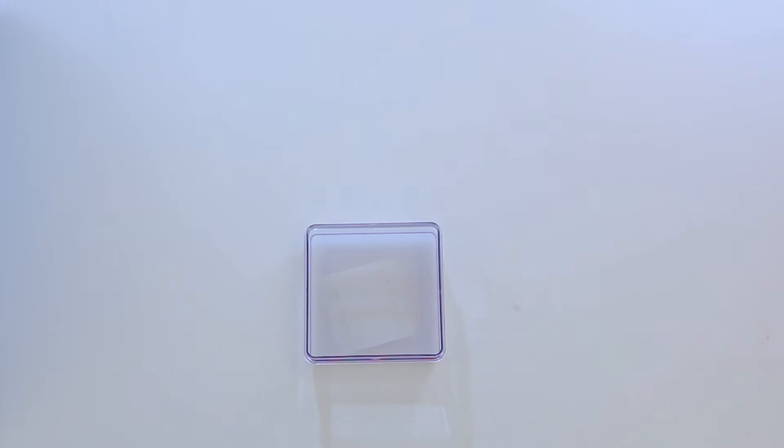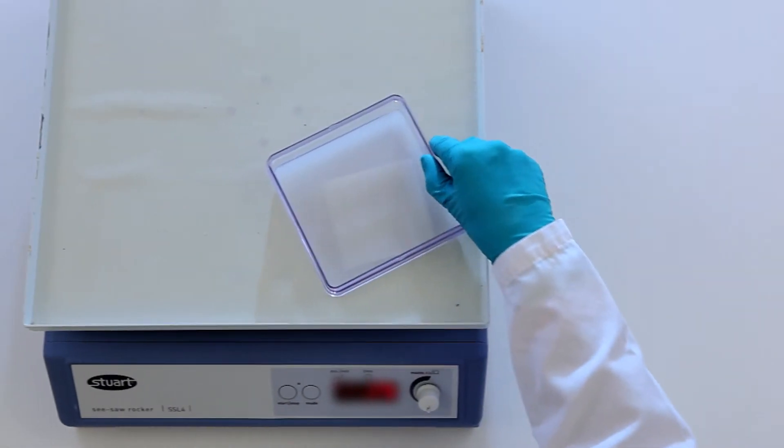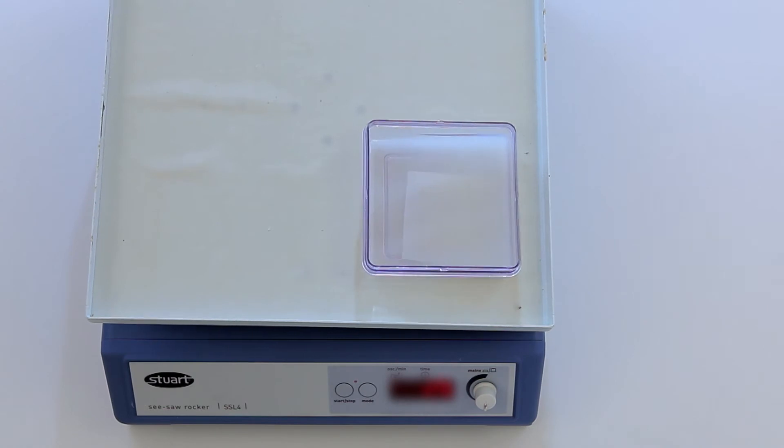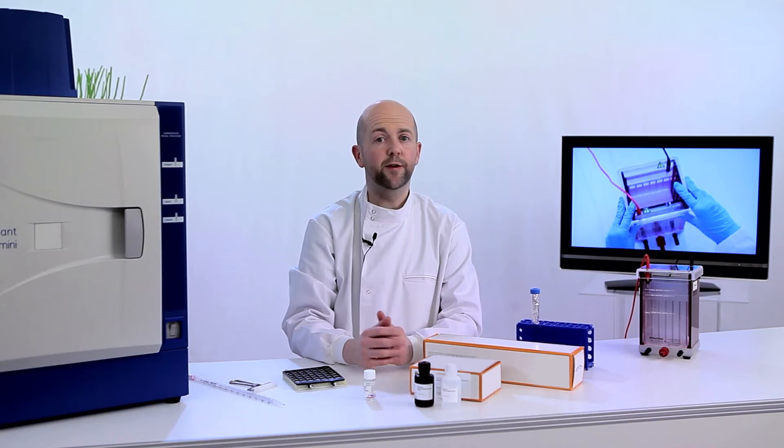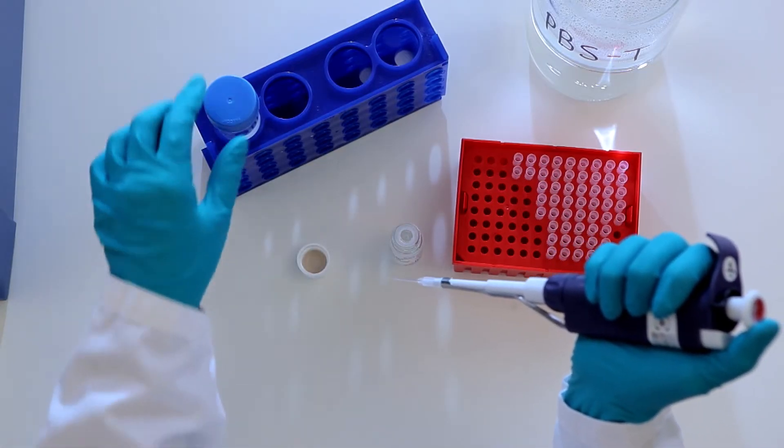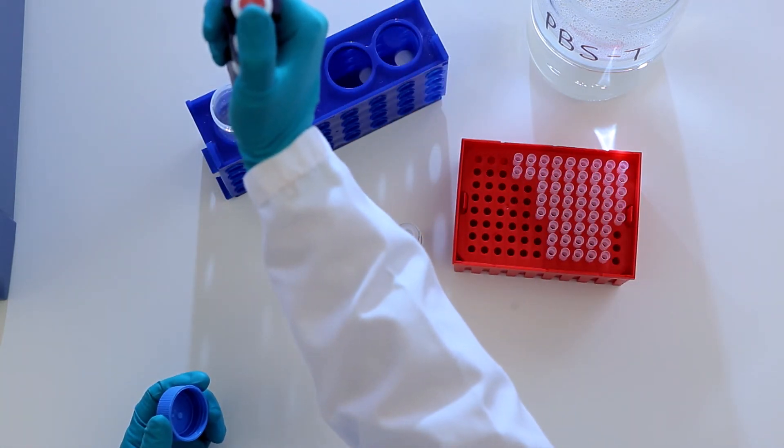Next, block the free sites on the membrane using the appropriate reagent, such as ECL prime blocking reagent. This normally takes one hour at room temperature. Use this time to prepare the primary and secondary antibodies. Dilute your primary antibody with PBST. If working with phosphorylated proteins, you must use TBST.